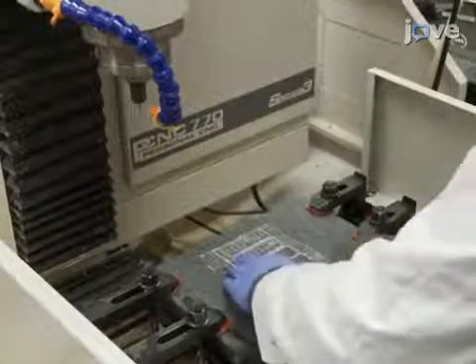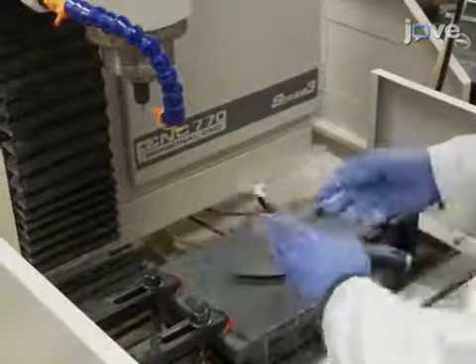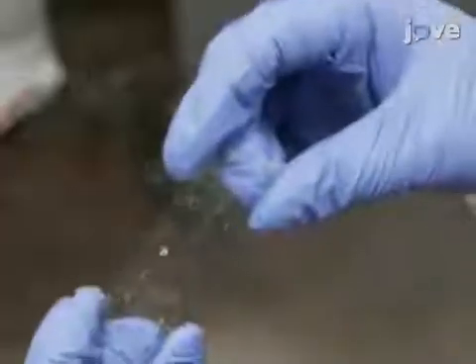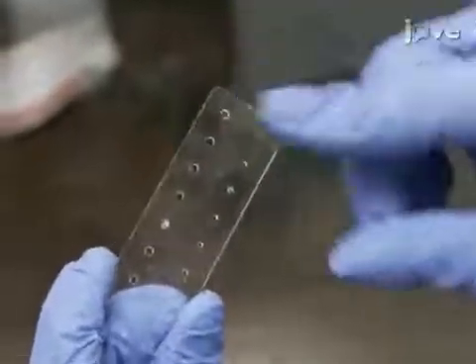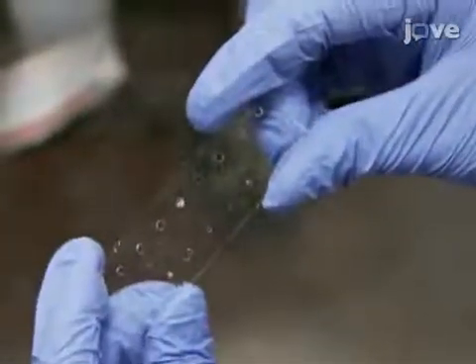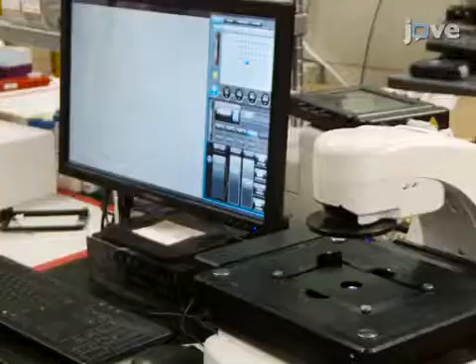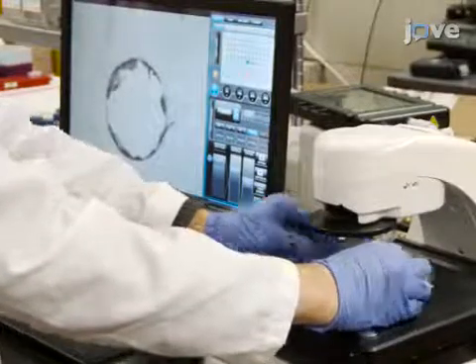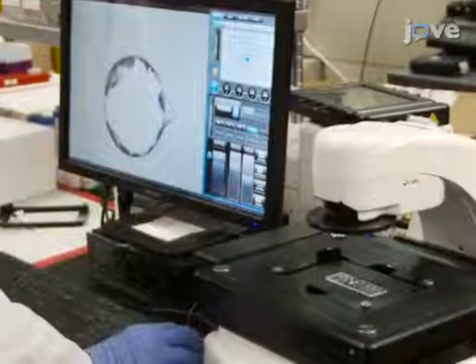Design and fabricate microfluidic device layers from the thermoplastic of choice using an appropriate fabrication method. Visually inspect the device layers to ensure that edges are clean without burrs or ridges of leftover material from the fabrication process. For best results, check all machined micro-feature edges in addition to the outside edges of the device under an optical microscope.